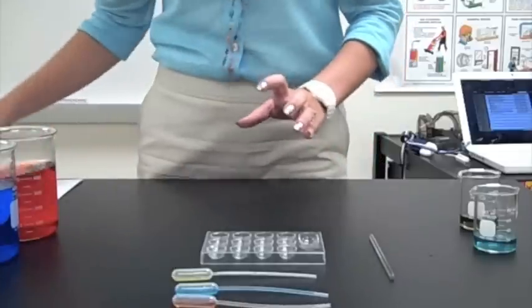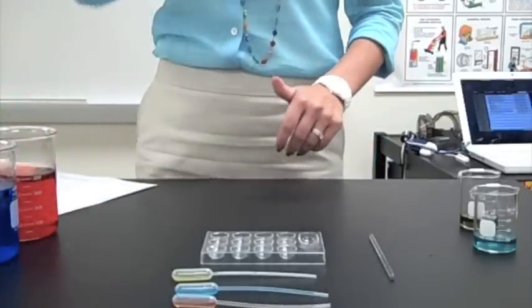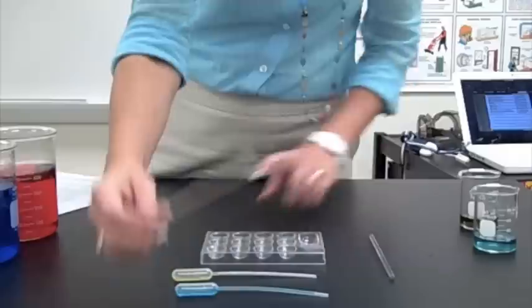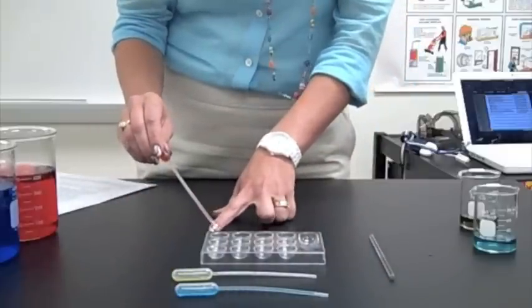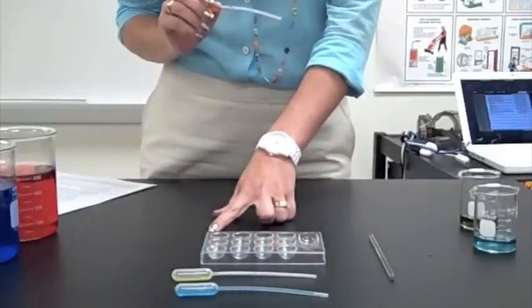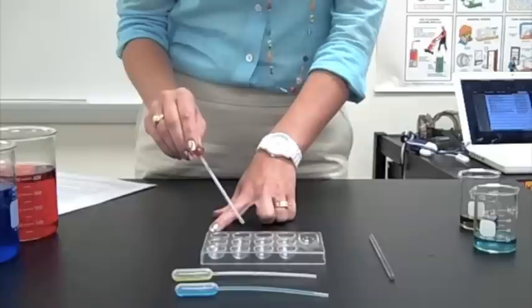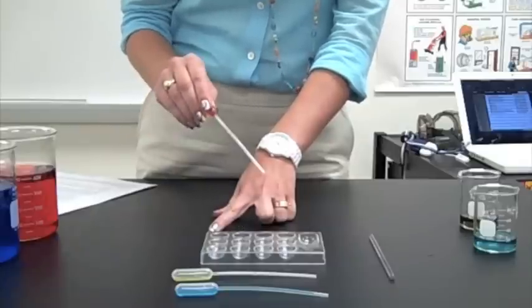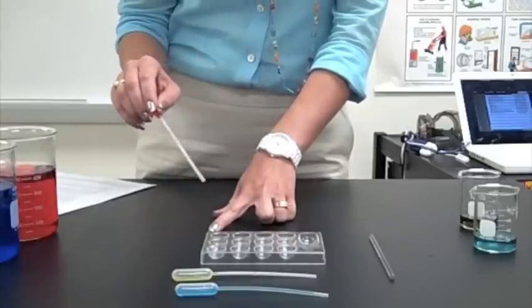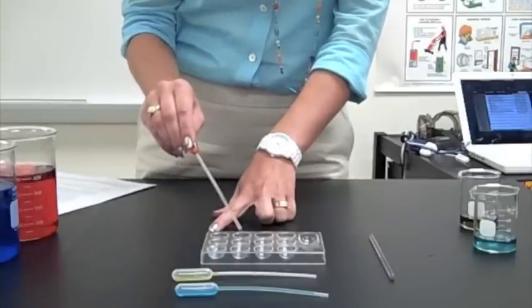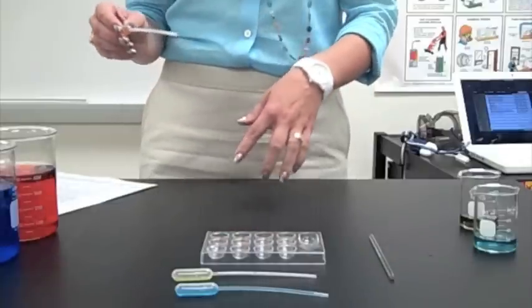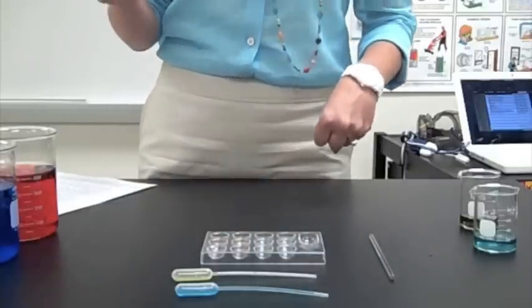It says, in steps, the red 10 drops goes in well one. Here's well one. And it says five drops in well two. And seven drops in well six. I'm going to go ahead and get a close-up of this so that you can see how they're numbered.